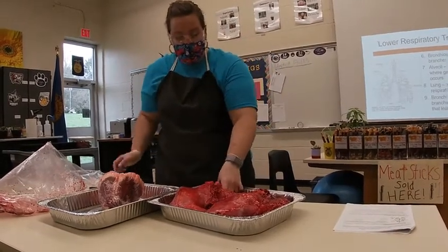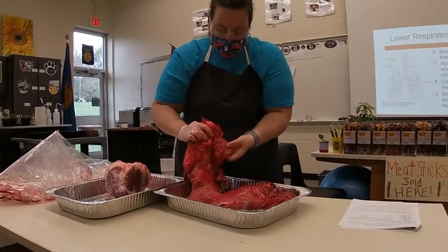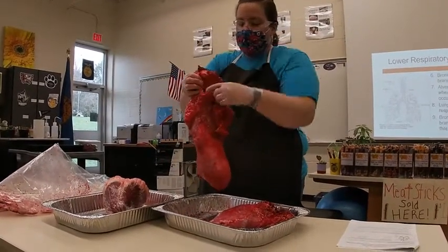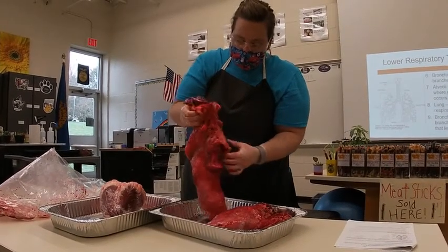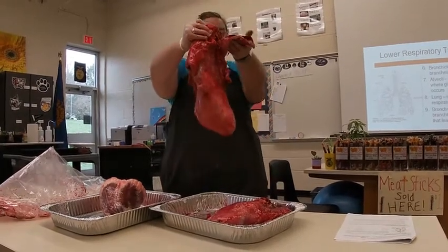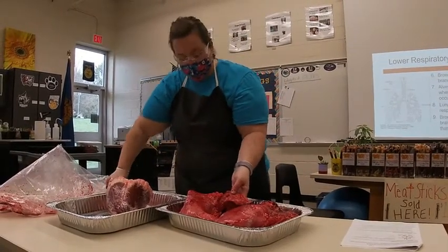Each of the lungs has little holes in it. Here's a big hole right here that I'm sticking my finger in, and there are some other small ones over here. If we keep looking, we would see more. I'm going to try to inflate this section of the lung right here through that one small hole.